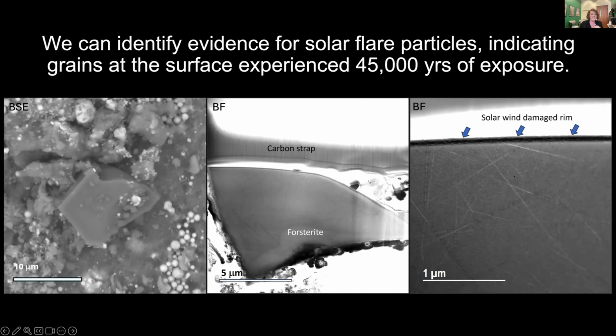So when we count the density of these tracks, it tells us that this grain was sitting at the surface of Bennu for about 45,000 years. Now, this is right in line with the estimates that we have from our micrometeorite impact density, between 20 and 85,000, and tells us that grains are sitting on the surface of the asteroid for tens of thousands of years before being disturbed or buried deeper in the regolith.